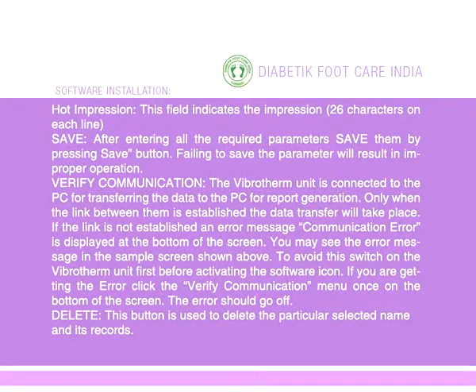Save. After entering all the required parameters, save them by pressing the Save button. Failing to save the parameters will result in improper operation.